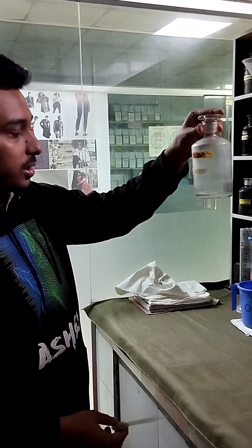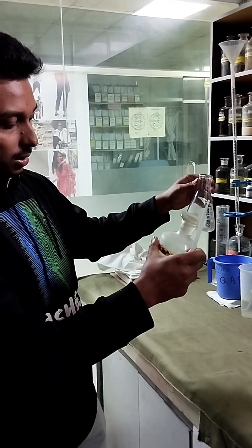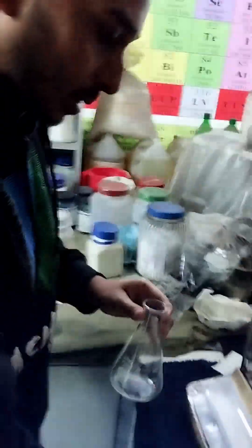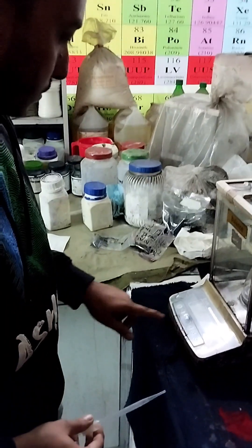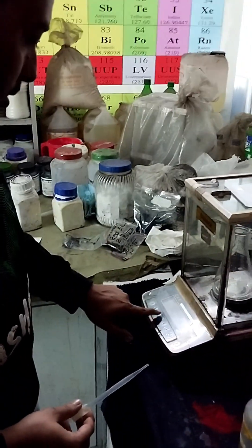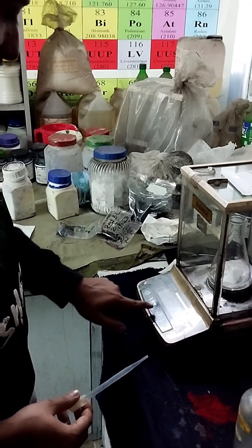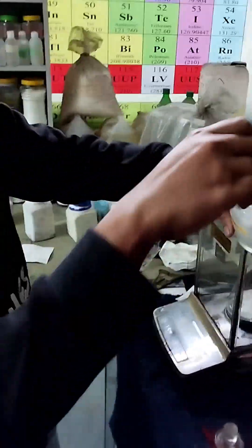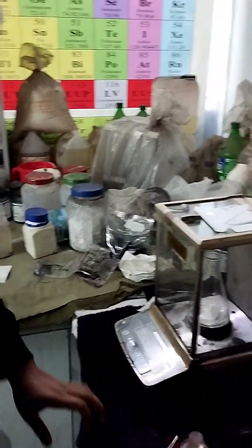The process is we have to take 0.1 to 0.3 gram of hydrogen peroxide in a conical flask. First, we will put the conical flask on the balance machine, then we will zero the weight. We will take some hydrogen peroxide sample with a dropper, and the weight should be 0.1 to 0.3 gram.